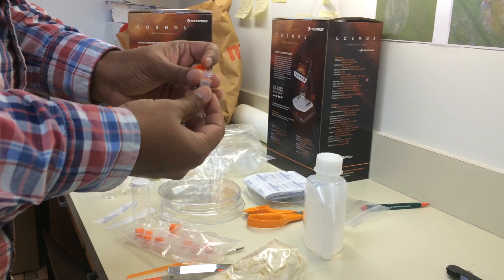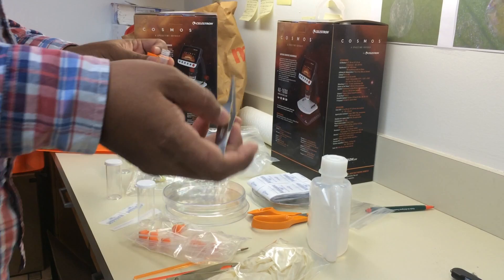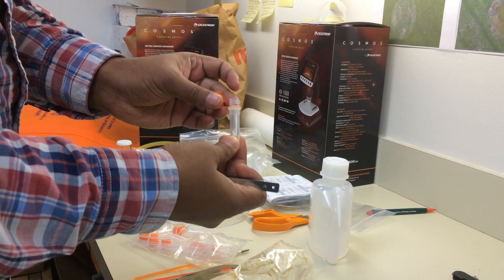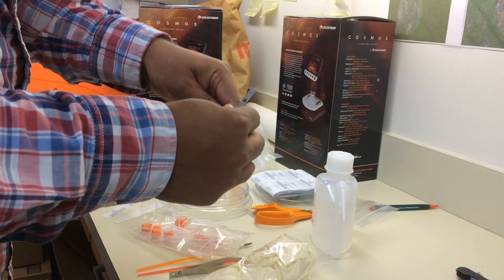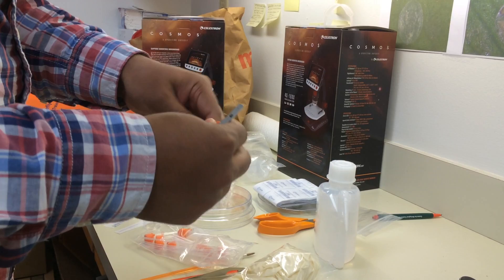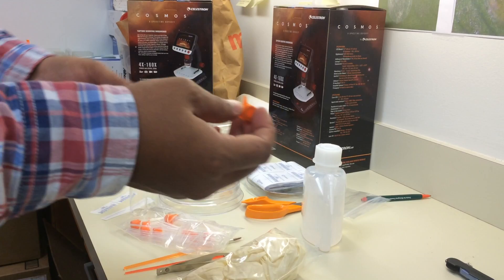Once you have your sample — collected from the field or your lab — put the sample into the preserving vial and transfer ethanol into the vial. The vial has a screw cap which will keep your sample preserved inside. You can then either send the sample for confirmation or preserve it for future references.